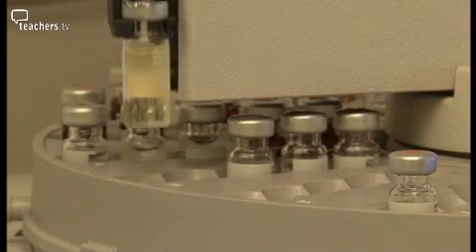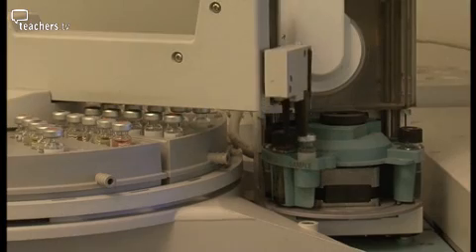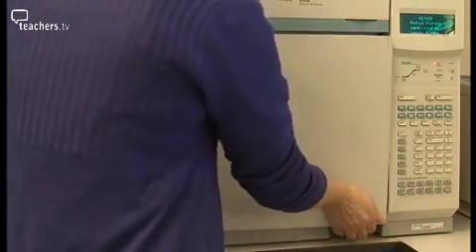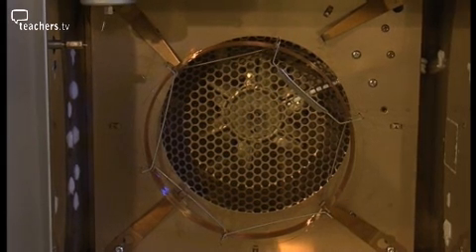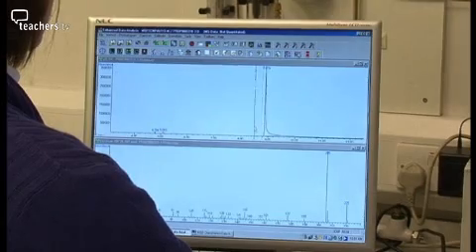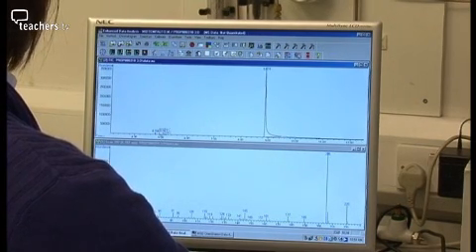When you place your sample in the autosampler, it injects your sample into the gas chromatograph. The injection process is automated to ensure uniformity. The injected liquid is vaporized in an oven and converted to a gas. The gas is then transported through a very fine tubular coil called a column. The journey through this fine tube becomes a molecular race in which an element's boiling point is key. Depending on what's present in the sample, its boiling points will be quite critical. Different boiling points affect travel time through the coil. Each element shows up as a peak when it exits.